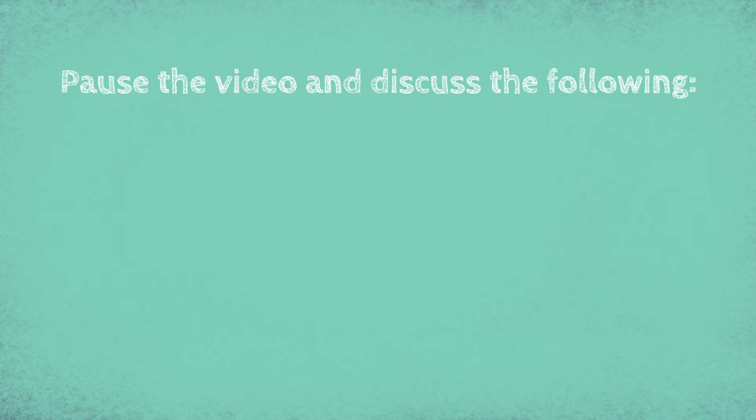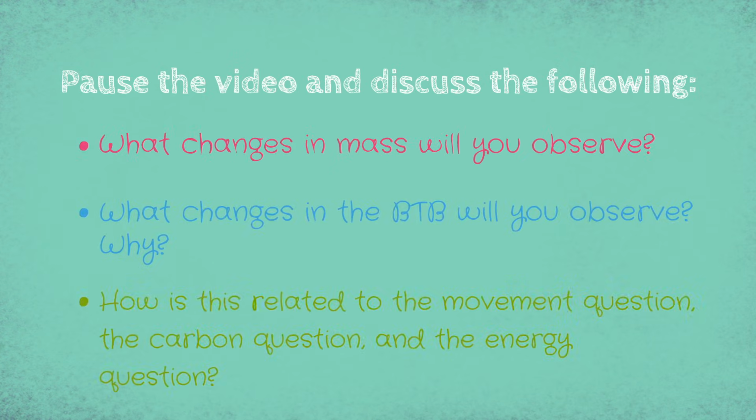Let's pause the video now as you discuss the following questions. What changes in mass will you observe? What changes in the BTB will you observe, and why? And how is this related to the movement question, the carbon question, and the energy question?